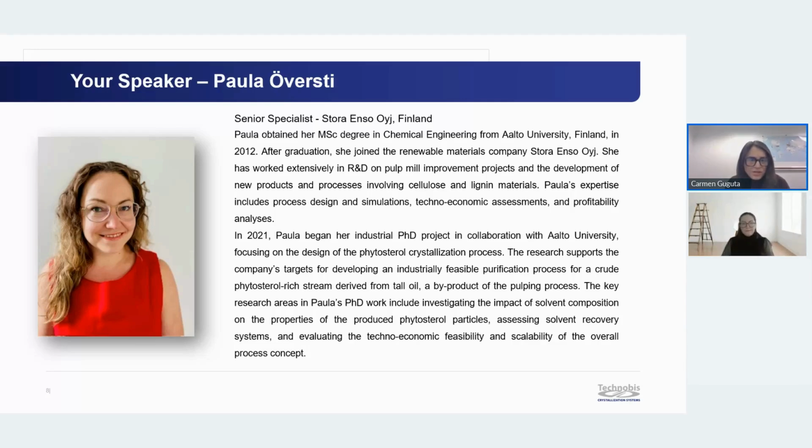The key research areas in Paula's PhD work include investigating the impact of solvent composition on the properties of the produced phytosterol particles, assessing solvent recovery systems, and evaluating the techno-economic feasibility and scalability of the overall process concept.